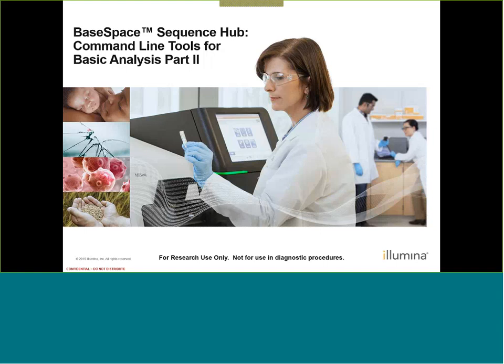So today we're going to be going over some more advanced features of the BaseSpace Sequence Hub command line tool. I'll be referring to it as BaseSpace CLI or just CLI, just so you know.